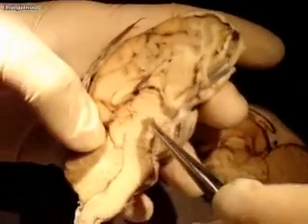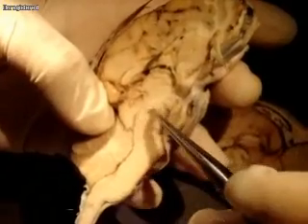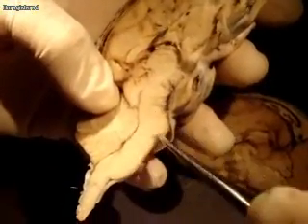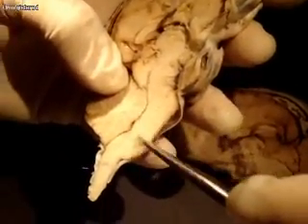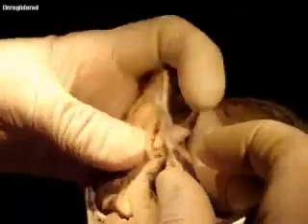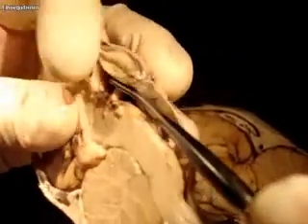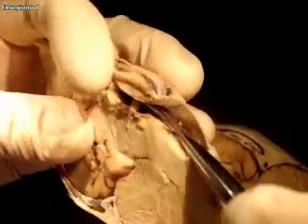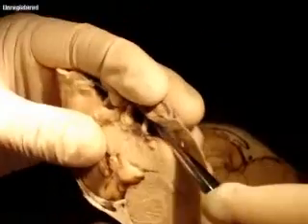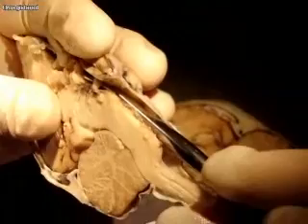Okay? And then again, if you look, this is the area where you would find the cerebral peduncles in here. This is the pons, and then the medulla, and then finally the brainstem. Now there are some other cranial nerves, if I can find them. Oh, okay. I don't know if you can see them underneath. If you lift up the pituitary gland, can you guys see this one right down here? It's underneath the pituitary gland. It's really white. Can you see it? That's the oculomotor nerve. So that's cranial nerve number 3.